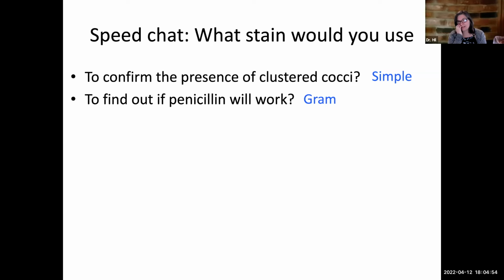I'll give you a heads up. Remember that the purple cells are gram. What are they, guys? Purple cells are gram. Yeah, positive. That's right. Most everyone remembers that purple cells are gram positive. And the gram positive purple cells are penicillin sensitive. We'll find out why that is next week.